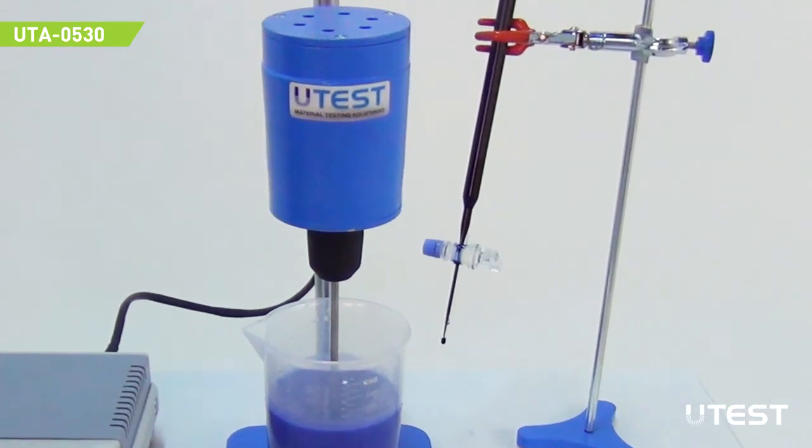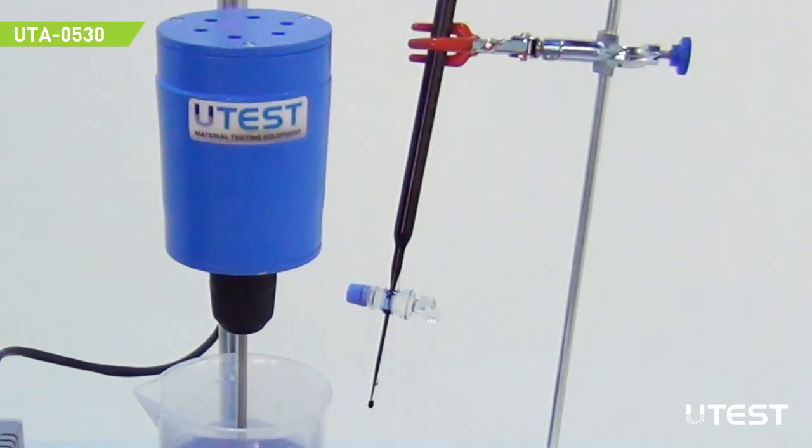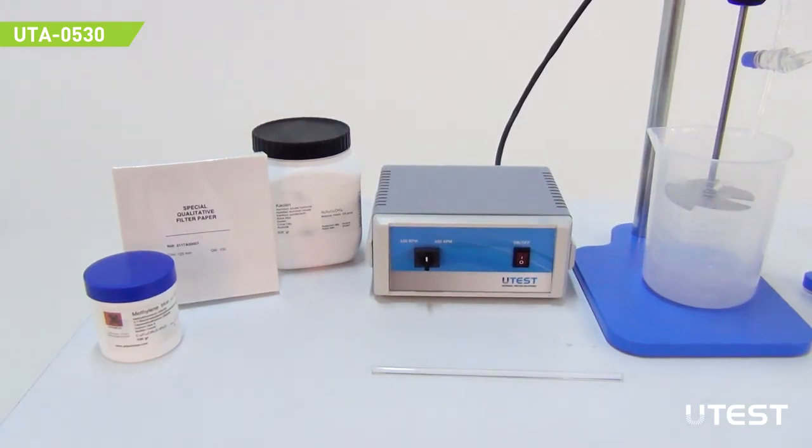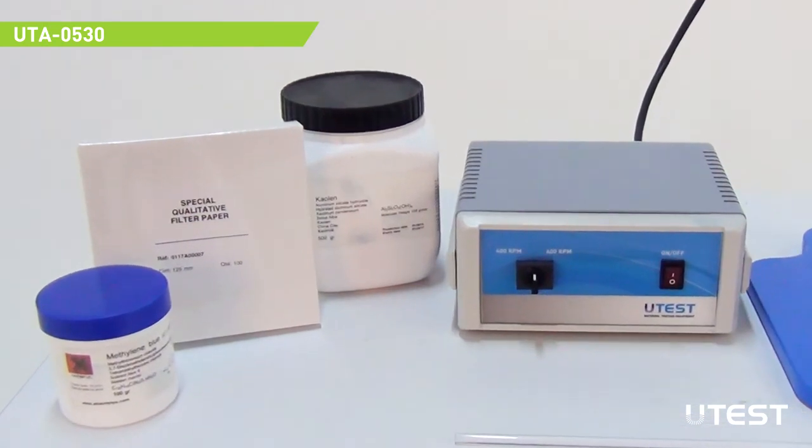Measure the volume of the solution that has been used and calculate the methylene blue rate. If the aggregate used in the experiment contains fine particles in small quantities, kaolin addition may be required.